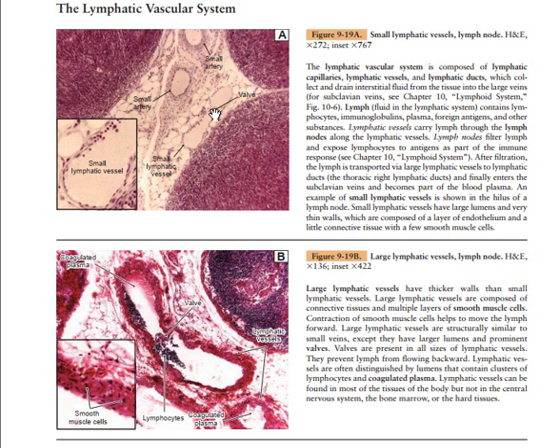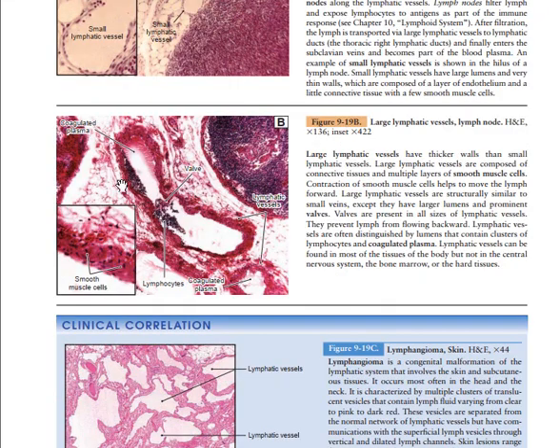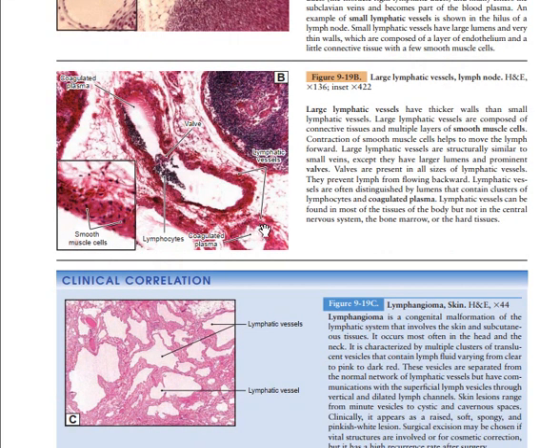You see some valves located there. These are the lymphatic vessels you can see, and then the valves located as they are passing. And then the next one we have is coagulated lymph. These are still lymphatic vessels here, as you can visualize, and then they are going to drain into lymph nodes. We have some coagulated plasma close around.